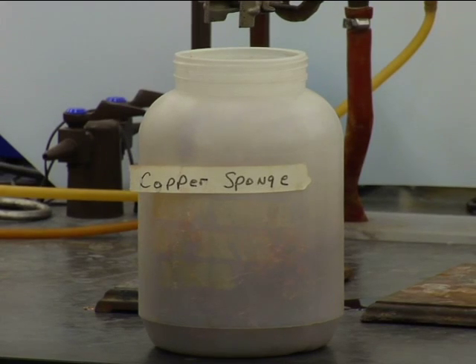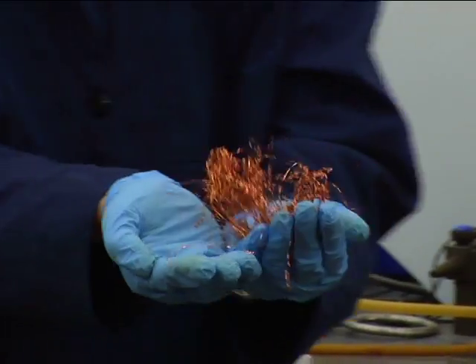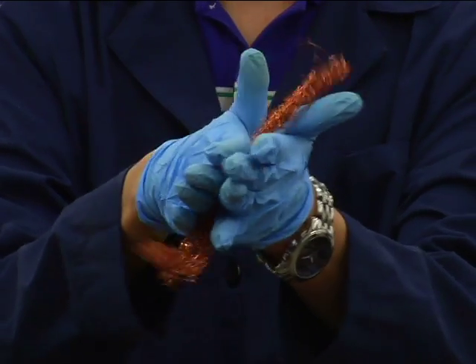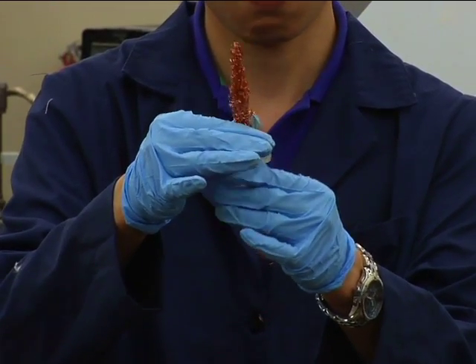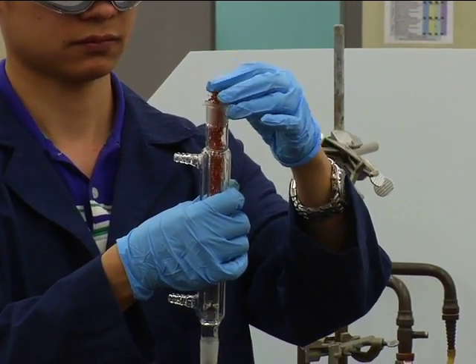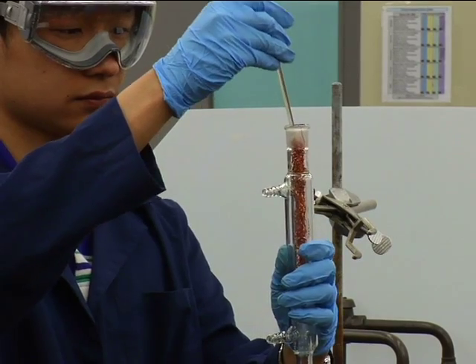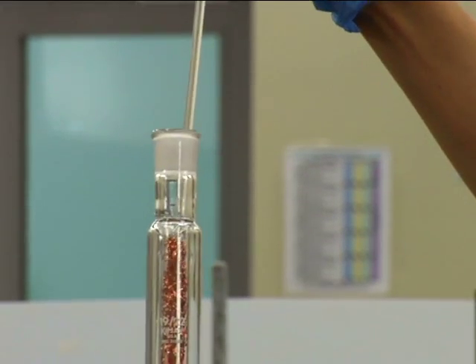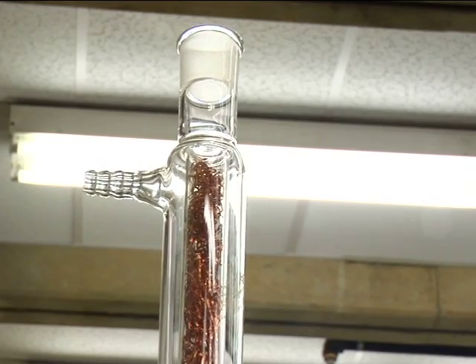The first priority is to uniformly pack your fractionating column. Select a piece of copper sponge weighing about 8 grams. Roll it into a sausage shape with your hands. Then work out any knotted areas with your fingertips to ensure that the packing has a uniform density throughout. Insert the packing into your condenser using a metal rod. Manipulate the packing with the rod so that it is uniformly dense the length of the column. Check this by holding the packed column up to the light.